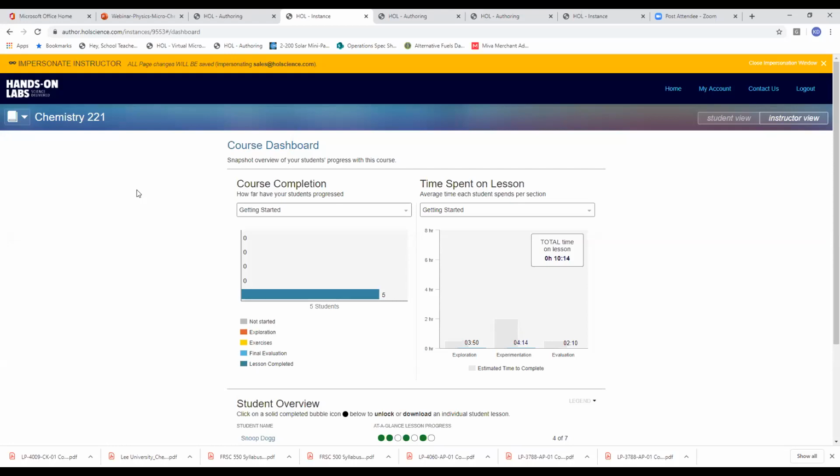One last question is just what kind of goggles and gloves are the students given? For chemistry, they're using splash-type, vented, properly chemistry-approved goggles. We supply students with nitrile gloves.